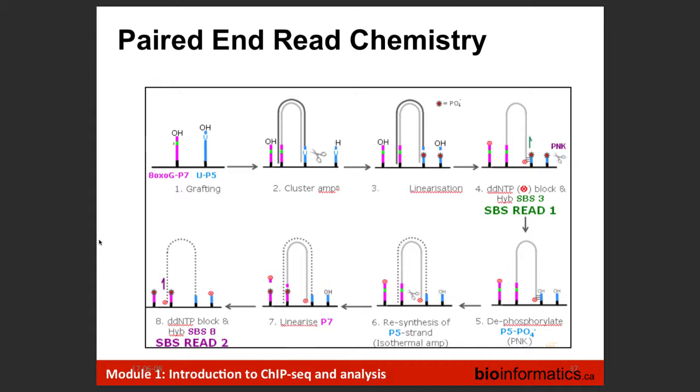No. I would argue, and hopefully Misha will talk about some of the other advantages, that just being able to predict where that nucleosome is in the genome has value in itself. Maybe if you're just windowing the genome into a kilobase region, you don't care exactly where that nucleosome is, but certainly you're going to get higher resolution in the nucleosome mapping because you know exactly what fragment you IP'd. Personally, in my own lab, I always do paired end reads. By the time you've invested in the molecular biology, the sample and all the rest of it, it's an incremental increase in cost, agreed, but I think there's value in it, and I think Misha will go through that beyond just the mappability question, which is an important one.